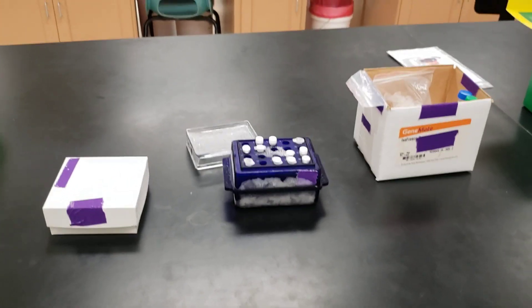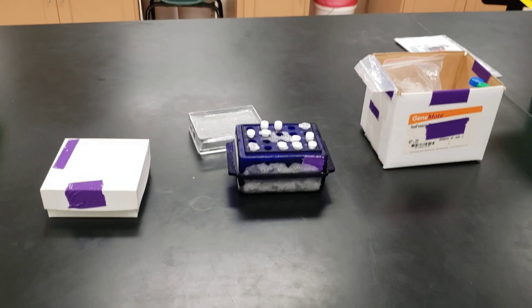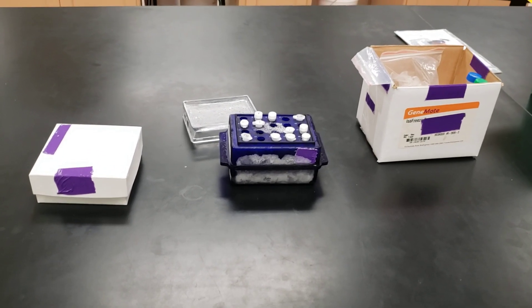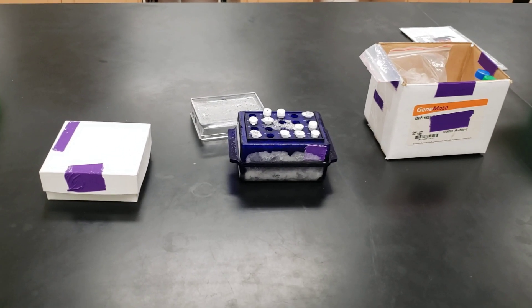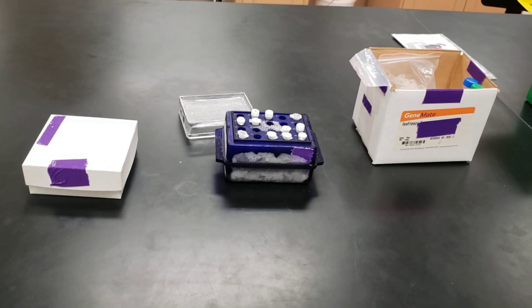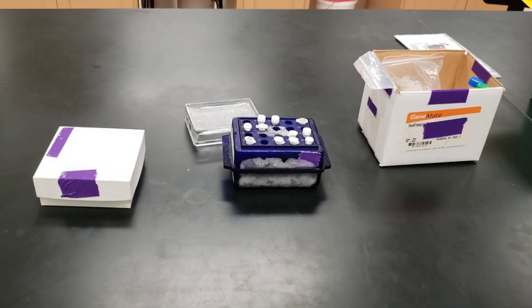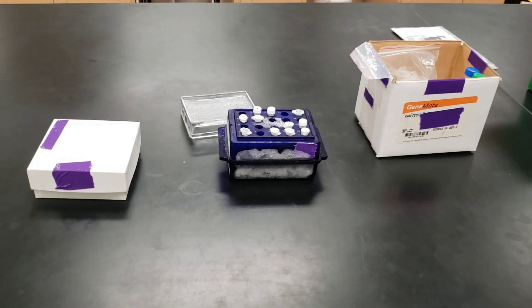This system makes students more likely to help each other. If you can't use a pipette correctly, you need to ask somebody next to you because you don't want to contaminate enzymes someone else will use. Likewise, if you see someone having problems, you want to help them because they'll be using your enzymes or kit reagents for plasmid isolation later. It is to your advantage to make sure they are doing it right — I really want them to work together.